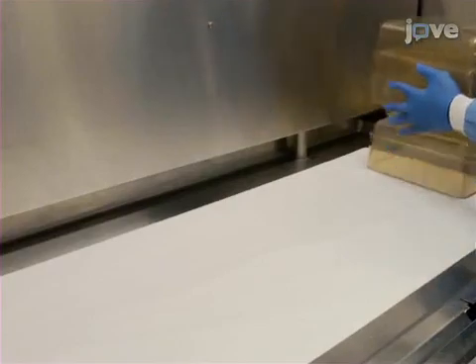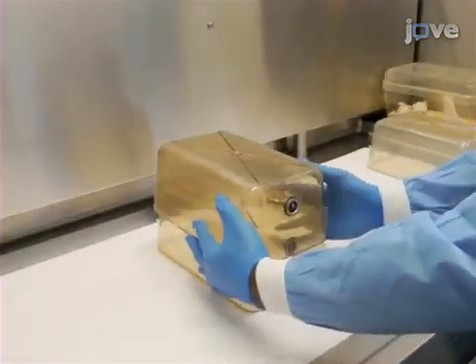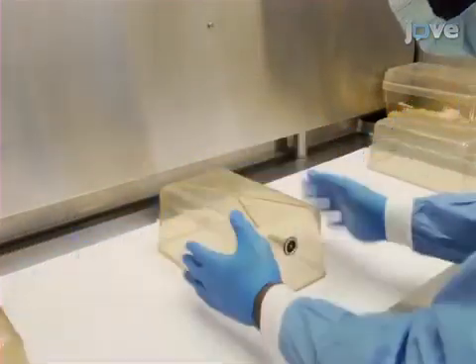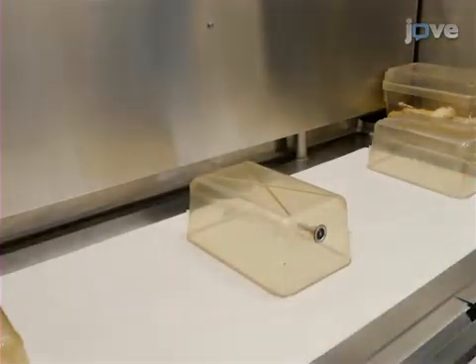The beam is set up by inverting 3 clean mouse cages on a tabletop or in a mouse cage changing fume hood. Line the cages up evenly so that they can support the length of a 1 meter beam.